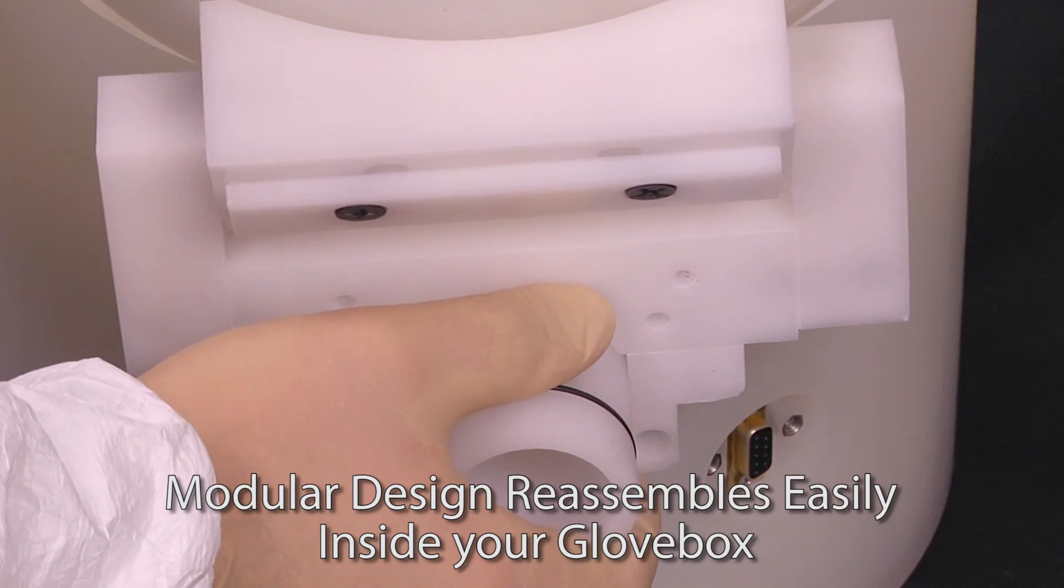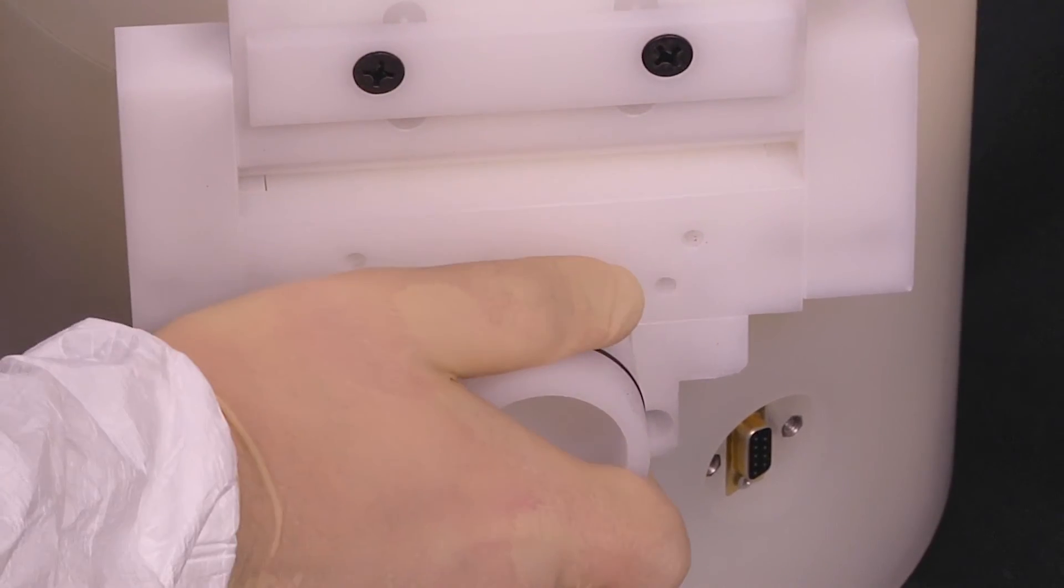Reattaching the lid once the system is in your glove box is just as easy.